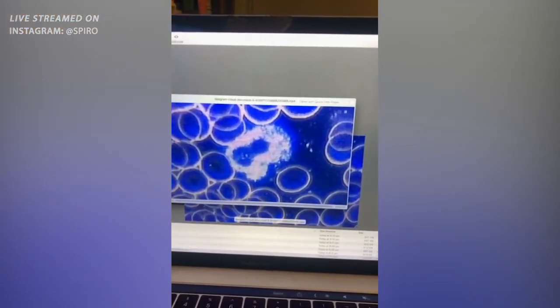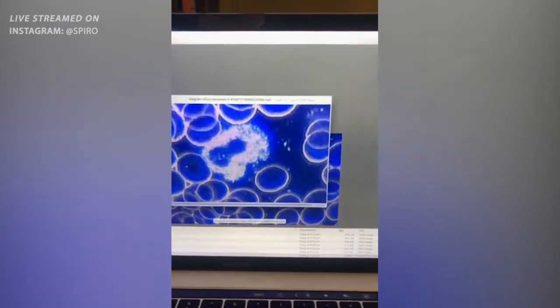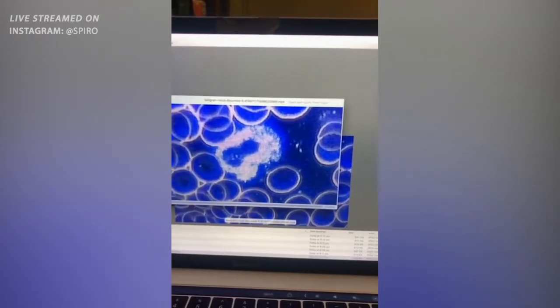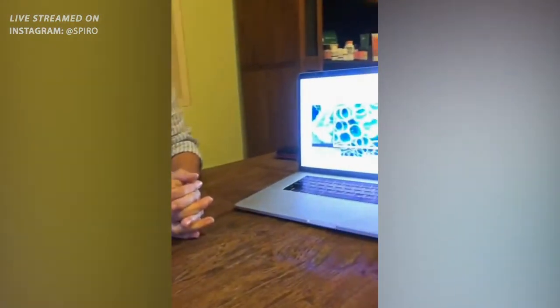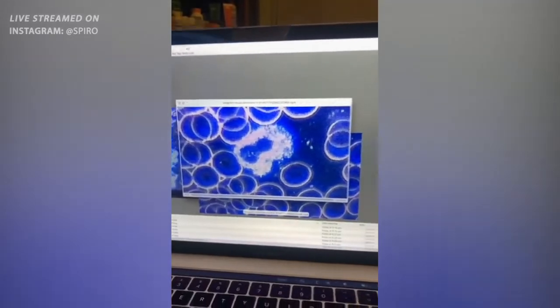I would say this is a cell that reacts to something toxic or wants to defend itself, because I have never seen a white blood cell like this. So it was for me also like, wow, what's this? Why is this so aggressively working? Right. Like you could say if an autoimmune activity or something goes on, the cells are attacking something very strong. So it was not a normal white blood cell which we saw here.